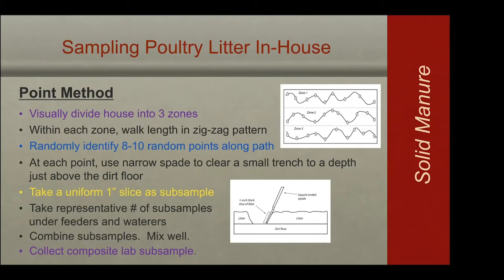And then you're going to mix those. One of the things you really need to note is that you need to try to get a representative number of samples under the waterers and the feeders, because the nutrients under those areas are different than the rest of the house.